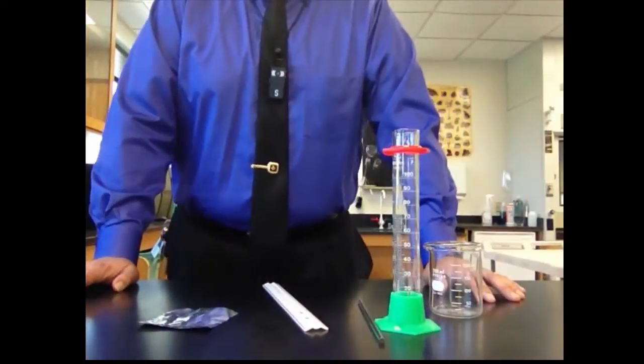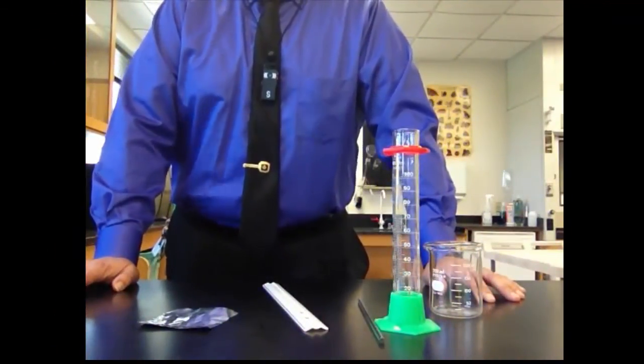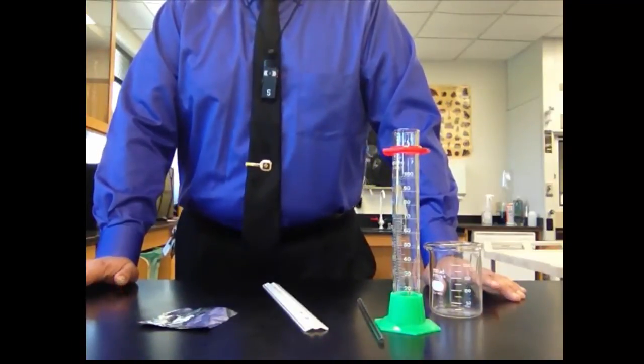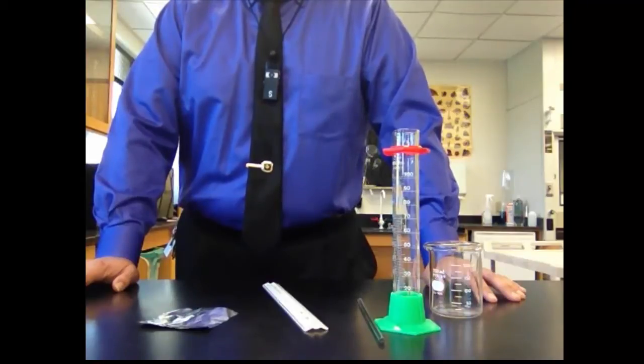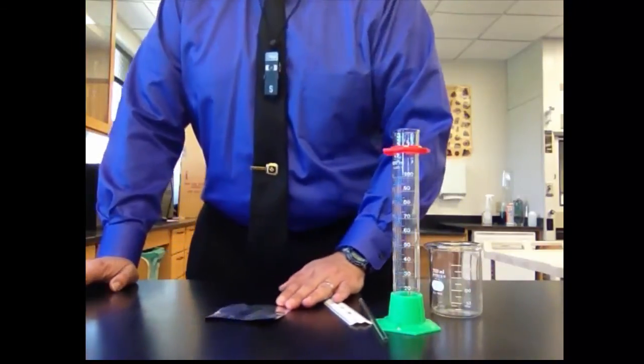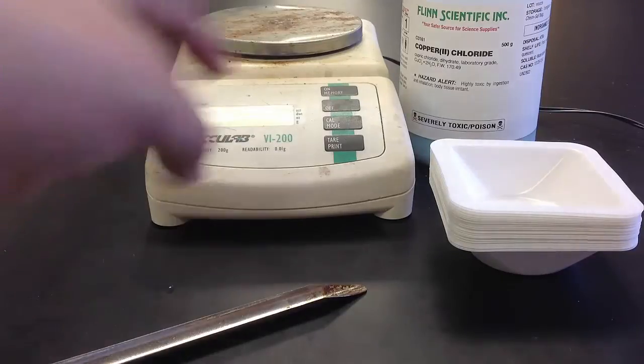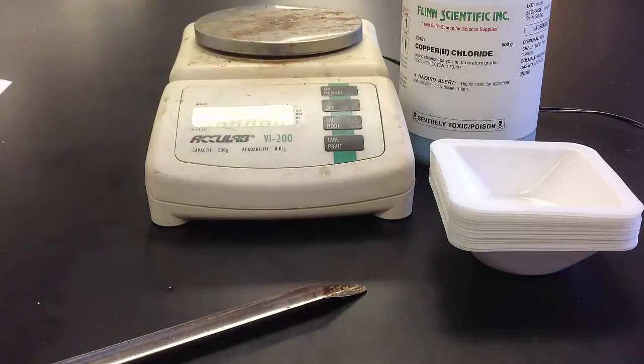For the second part of this experiment, we're going to be doing a chemical reaction with the copper chloride. And you're going to need to weigh out about five to seven grams. Now, I'm going to show you how to do that using the balance in the most efficient way possible. Just to give you a quick rundown on how to properly weigh something in a nice, convenient manner. We've got our balance here. Make sure that your balance is on.